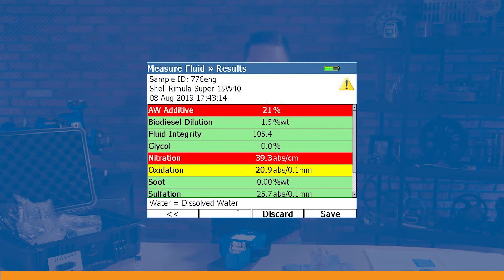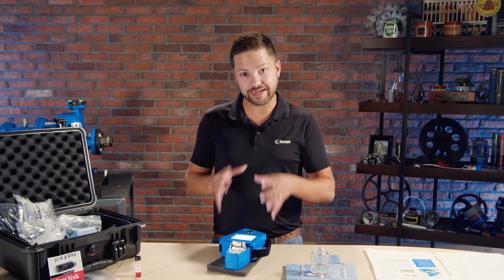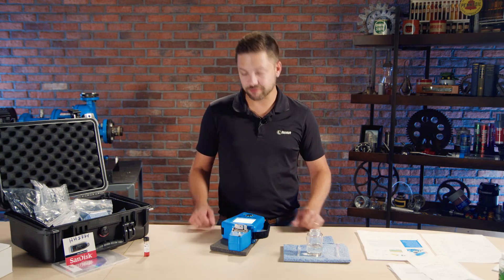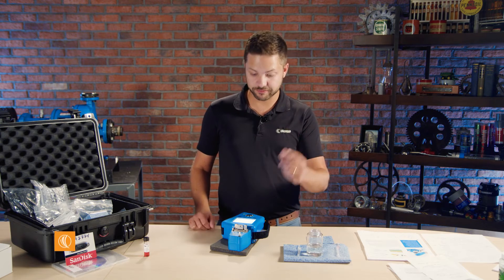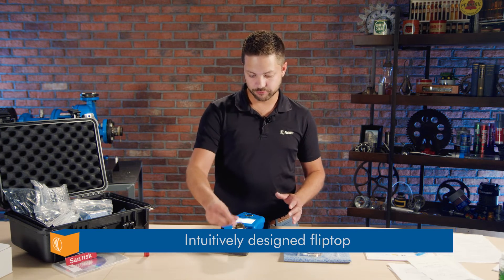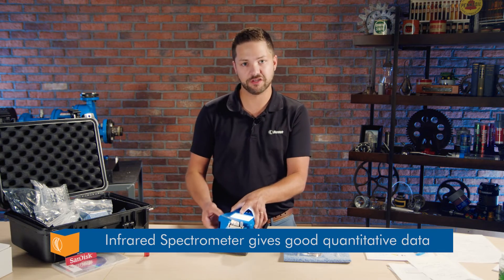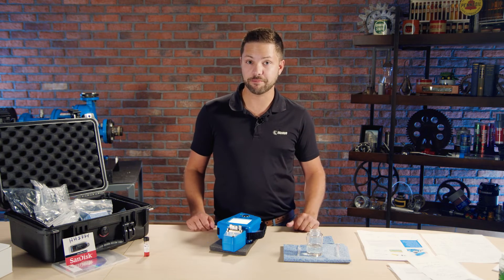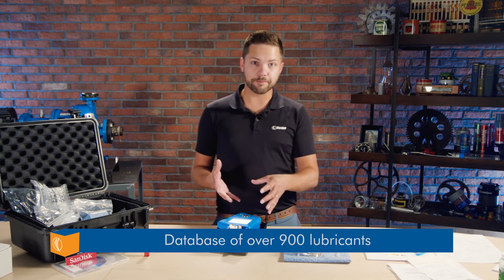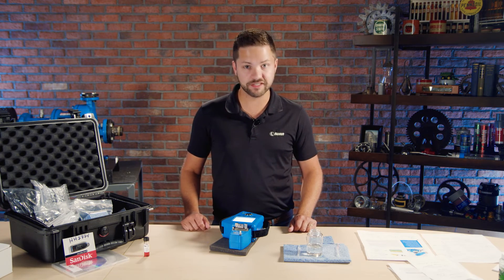This can really be used for any kind of application — turbine systems, hydraulics, compressors — and anyone operating those machines or in charge of monitoring their condition. Fluid analysis is a crucial part of overall condition monitoring. It comes down to a few key differentiators: the ease of use of the flip top, the infrared spectrometer giving good quantitative data on acid number, base number, water, and oxidation, and the database of almost 900 lubricants, making it easy for anyone to get familiarized with this technology.